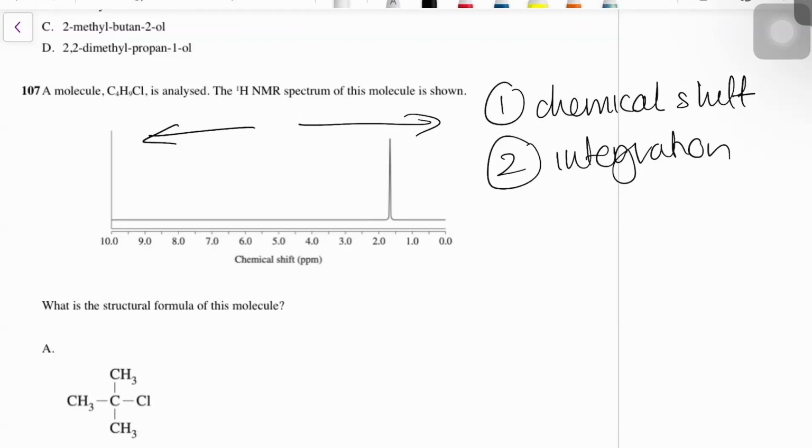And from last lesson, the chemical environment is, pretend that you're standing on the molecule and then rotate yourself around, just walk around in a circle on that single atom, yeah? Does the molecule look the same from where you're standing? If the molecule's symmetrical, if your methyl group can rotate, you're going to see the same thing.